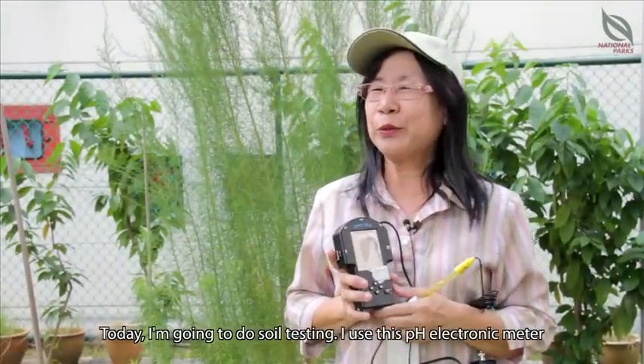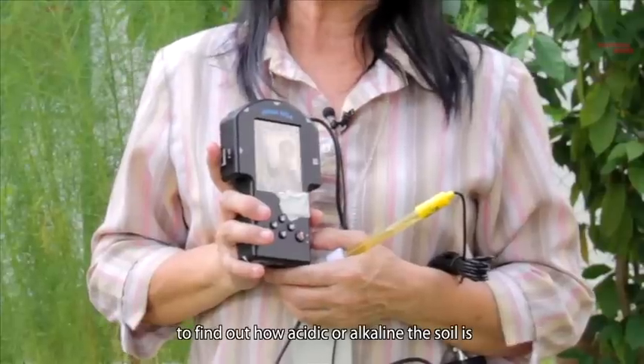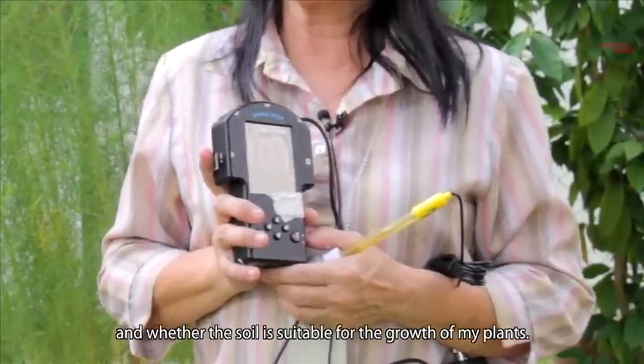Today I'm going to do soil testing using this pH electronic meter to find out how acidic or how alkaline the soil is and whether the soil is suitable for the growth of my plants.